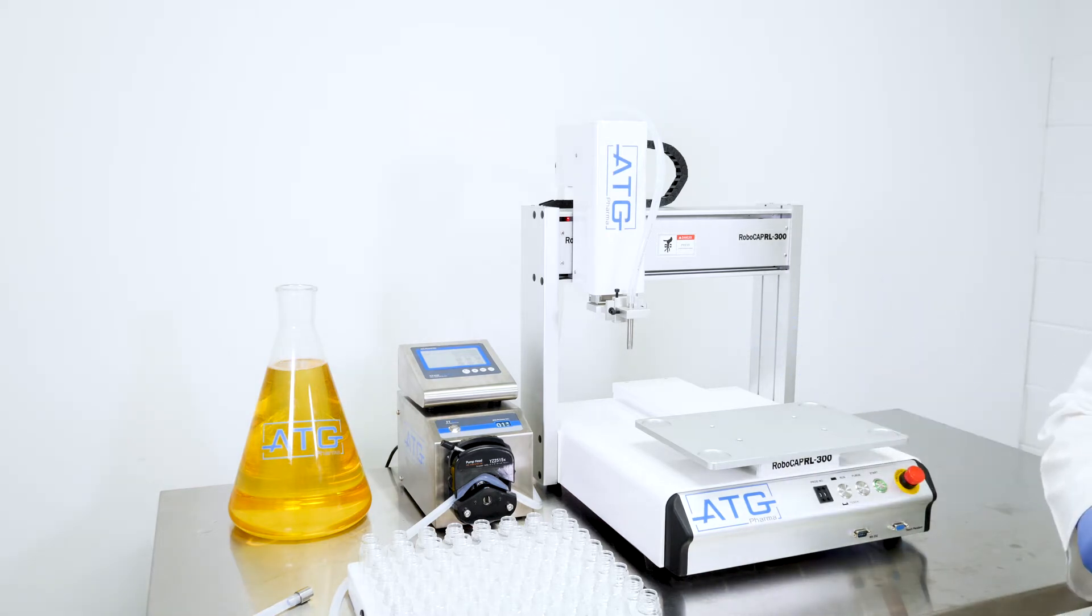This here is our RL301P. The one stands for one nozzle. P stands for the peristaltic pump.